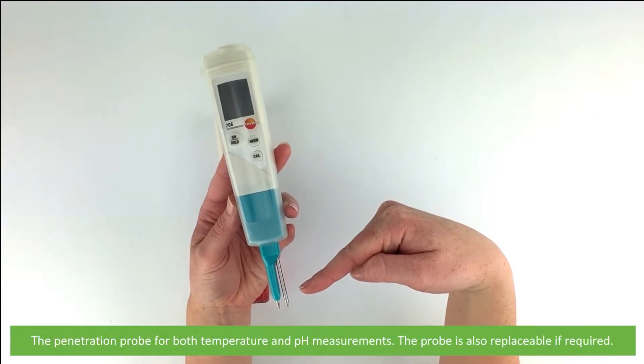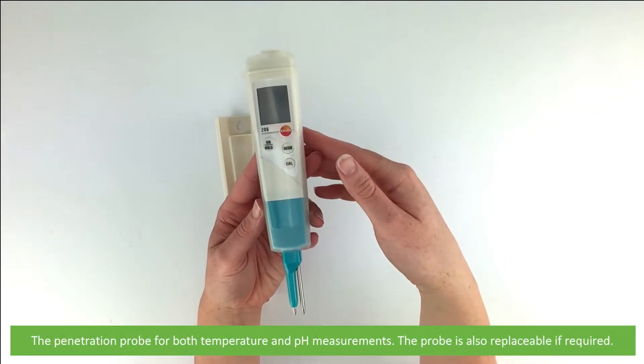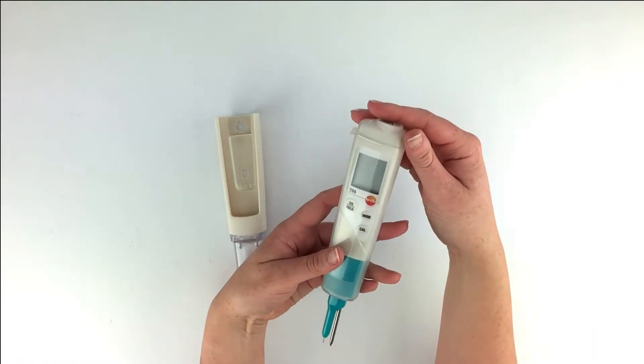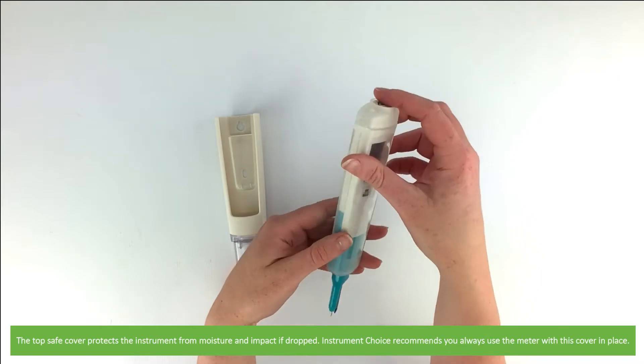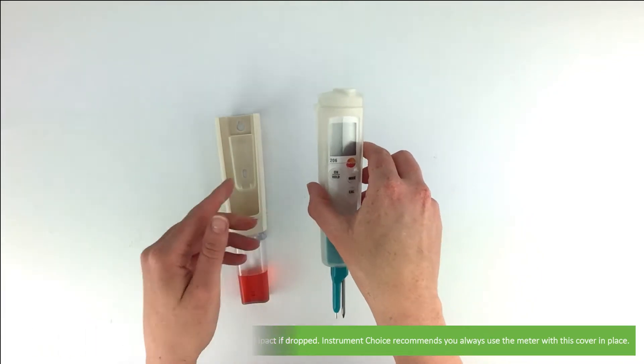There's a penetration probe for both temperature and pH measurements. This probe is replaceable if required. The top safe cover protects the instrument from moisture and impact if dropped.